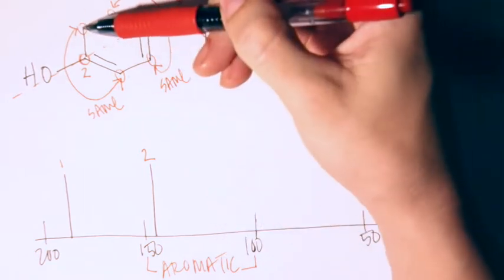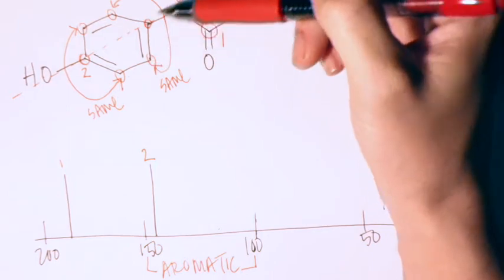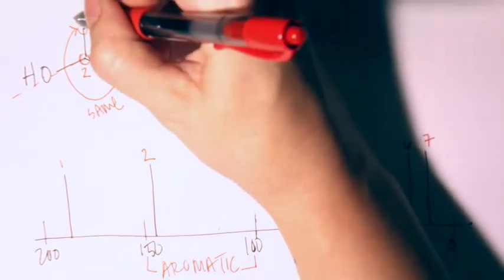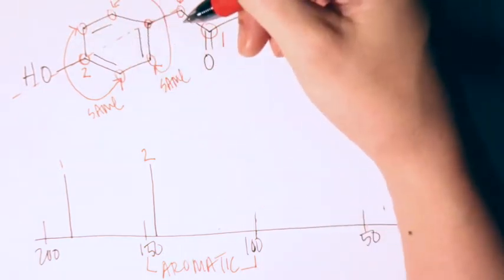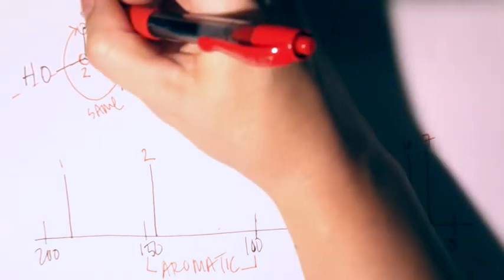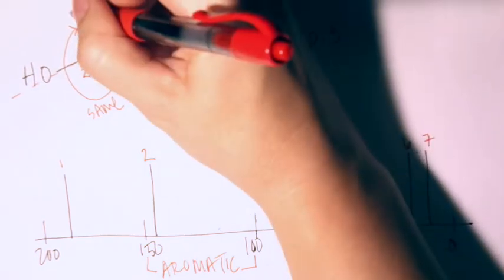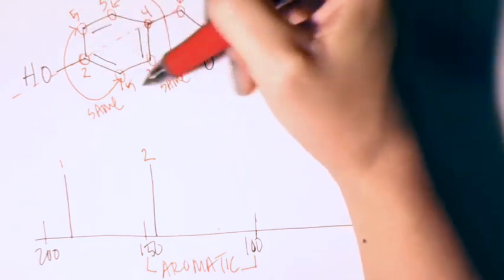So we would expect to see 2 peaks that are twice as tall, and then we'd see 1 shorter peak in that region. How they actually come out, you kind of have to do the NMR and see, but what ends up happening is that this one ends up being the next most downfield, then this one is more upfield, and then this one.